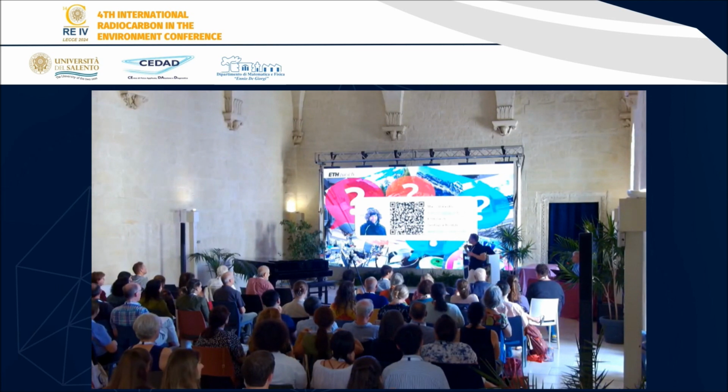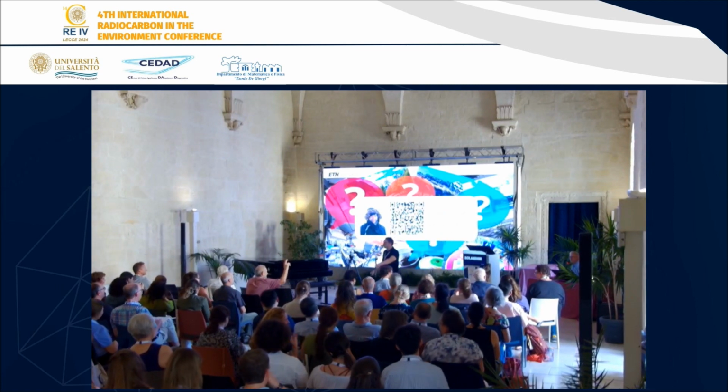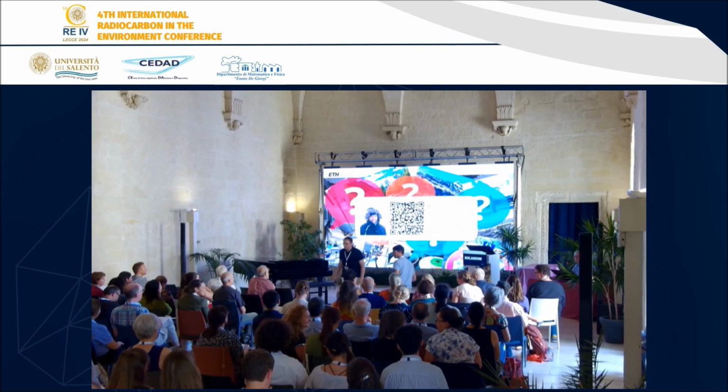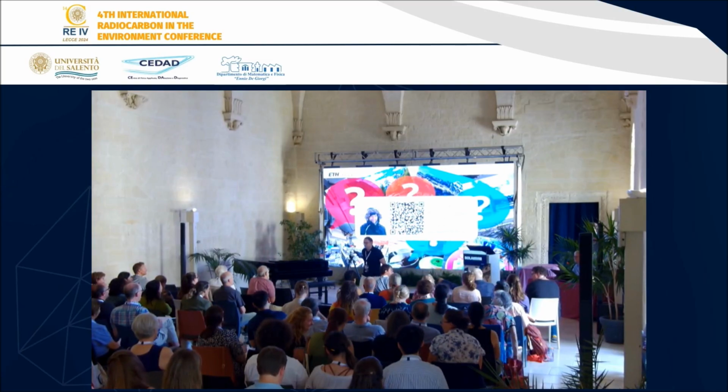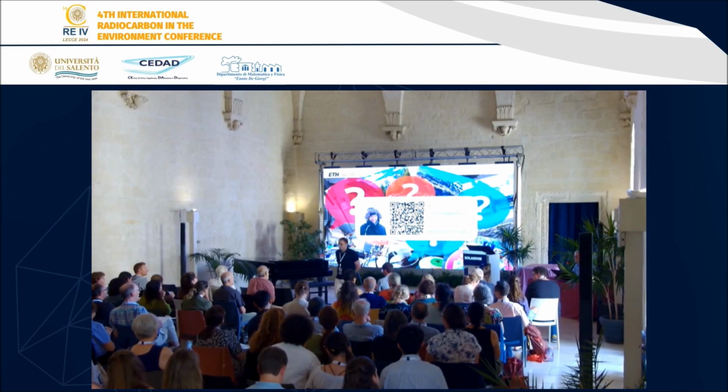Thanks a lot for your talk, and you were pretty much on time, so we have time for a few questions. Alex? Did you estimate any cross-contamination between fractions after the zeolite trap?